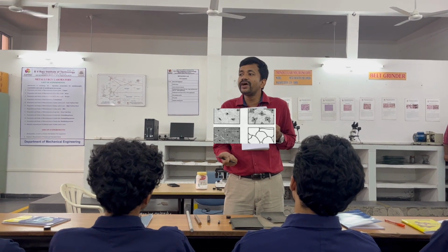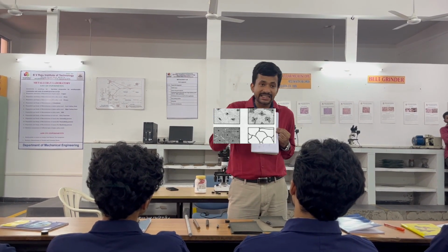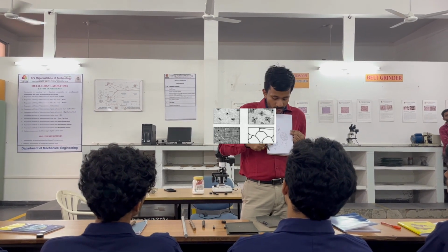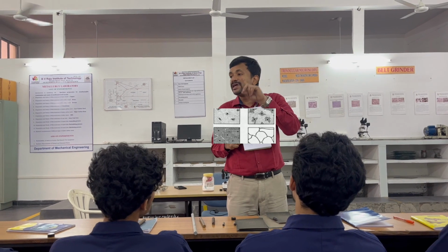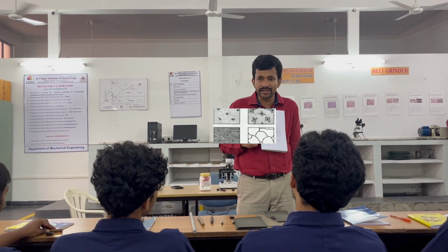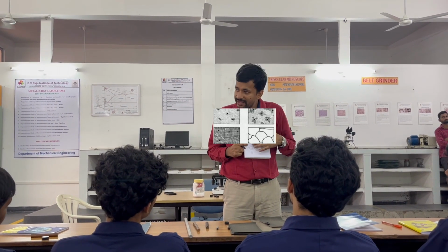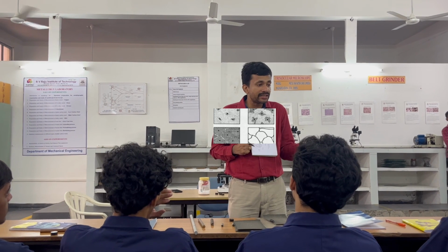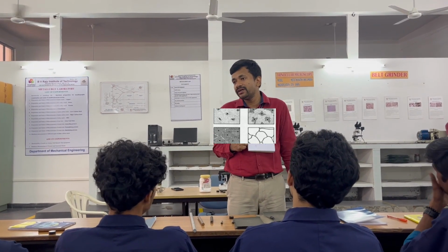And that's the reason why you have a slightly different composition. Energy levels are also different, and that is the reason why, when we expose this type of metal, of course, this we can't see under the mirror finish. So we are able to achieve till the mirror finish, right? So when we want these things to appear, they are still there, but we can't see them through the microscope because everything appears uniform under the microscope.